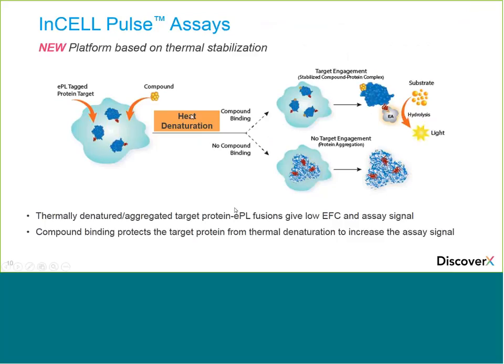In a little bit more detail, here's a little information on the workflow. So it's an engineered system, and we have the EPL tag target protein expressed in a cell, and we treat that cell with a compound or with the DMSO control.